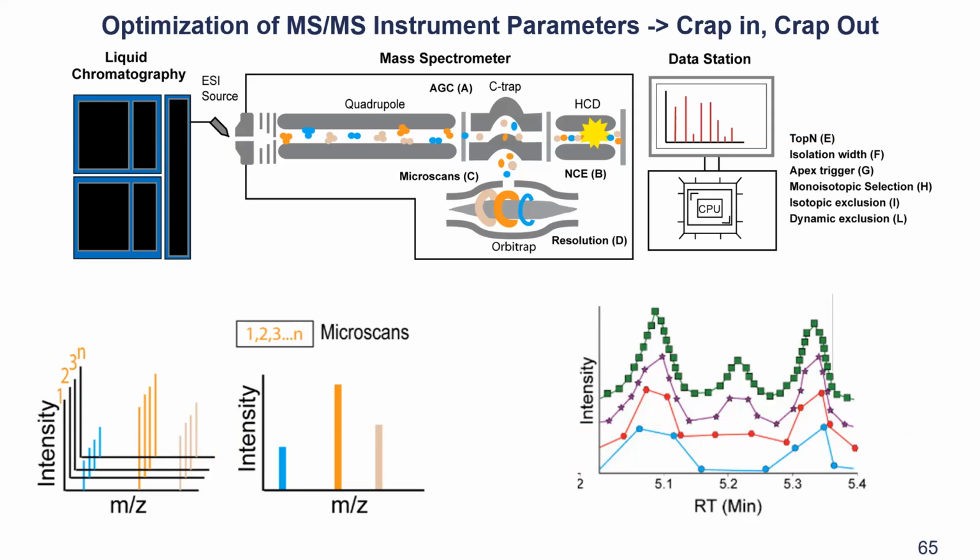And as you can see nicely, with the green one we have a lot of data, and it describes the peak relatively nicely. And with the purple one already a little less, and with the red one a little less, and with the blue one it's very little, right? So that you get to a point that your chromatogram in this situation is not well defined anymore.